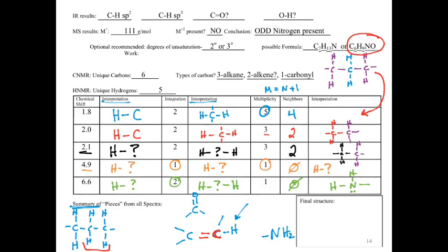So what we're going to do is slowly start connecting these things up. So let's pick my leftmost piece as my starting point. If I decide to attach the nitrogen to one end of that, that's a possibility. Okay, so we could go through and tag that on there. I'm going to need some space to draw. How am I going to do this? Well, we're just going to have to work with it. If we put that nitrogen on there, I get one extra hanging bond out the other end, which I could then hook up with either the carbonyl or the other piece.